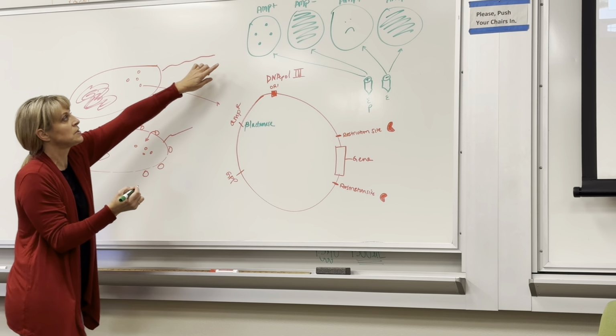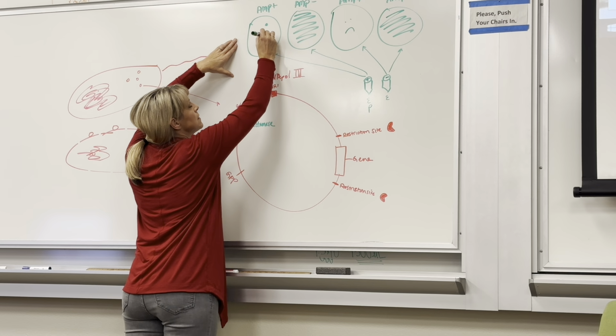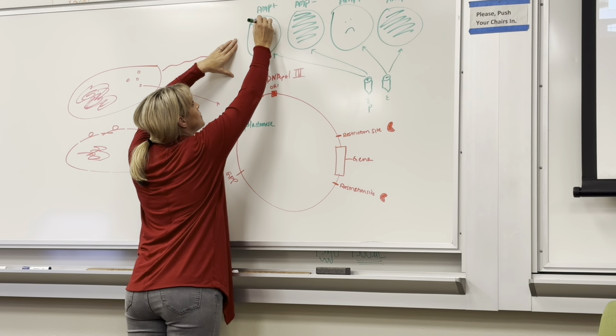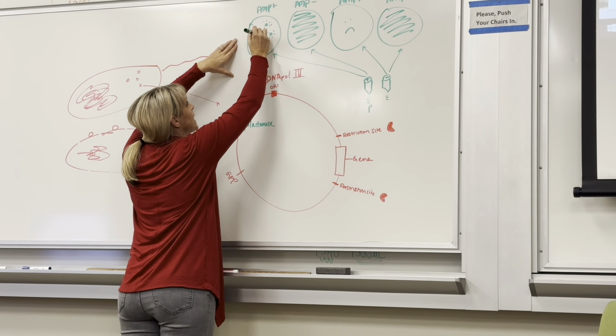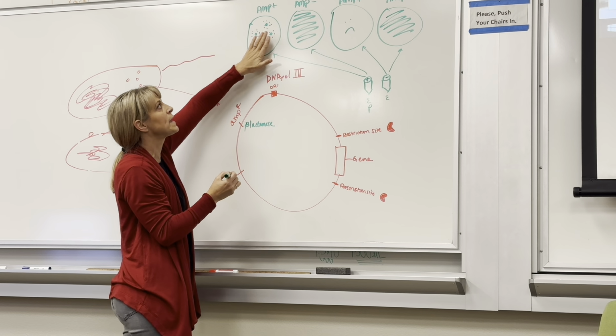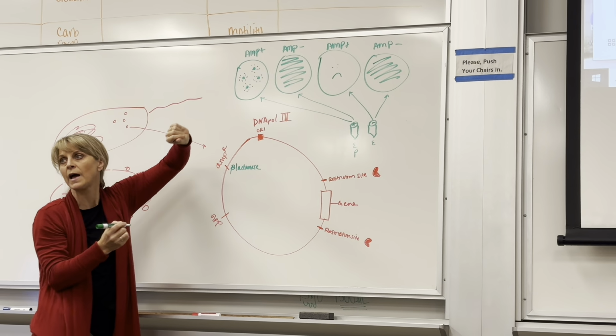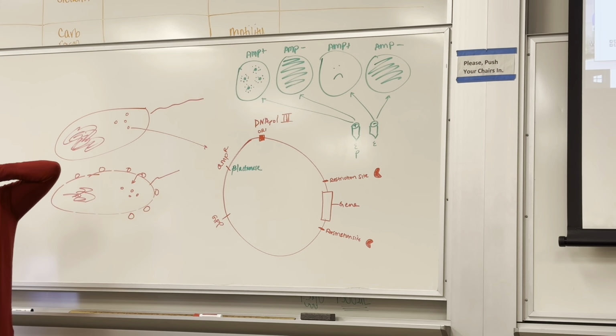What these transformants are doing is spitting out beta lactamase. So now these little tiny E. coli cultures can grow a little bit because there's a little bit of beta lactamase around that blocked those beta lactam rings. Yeah, good review.